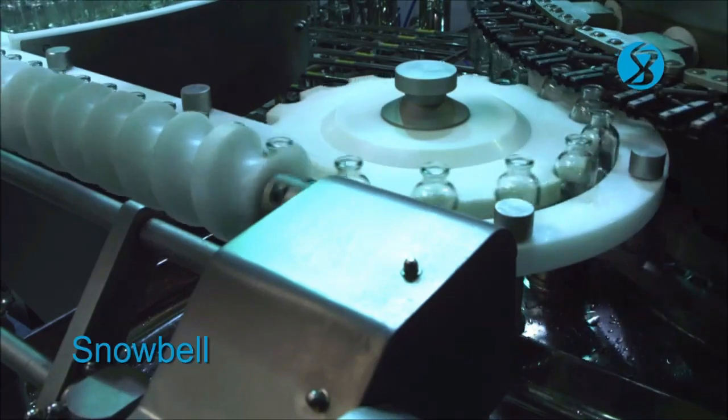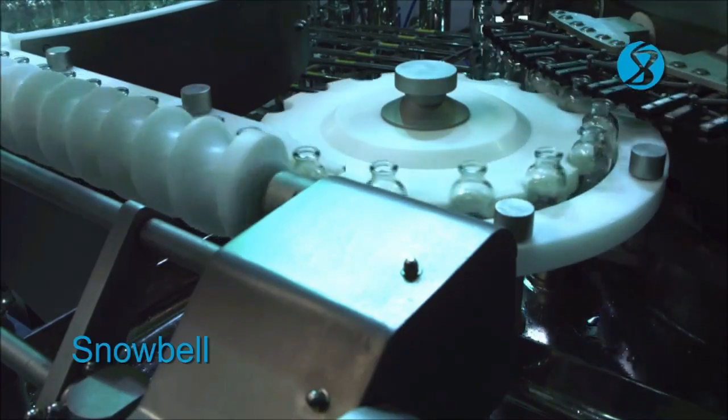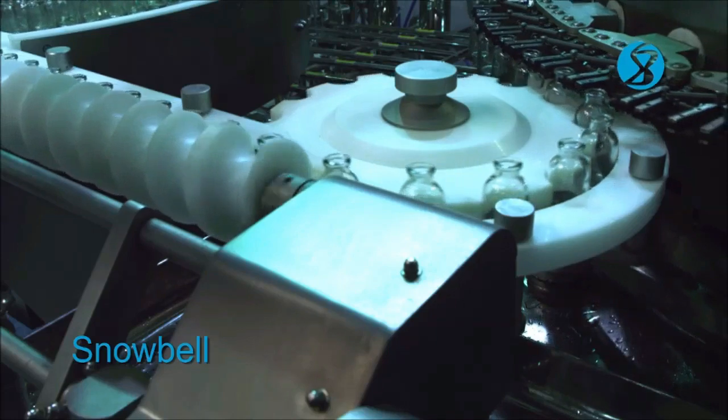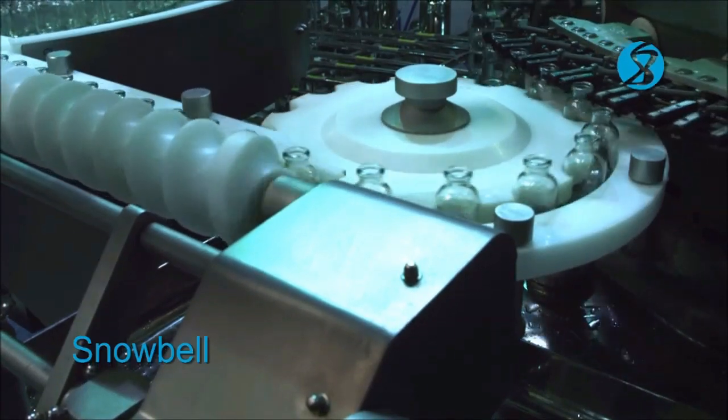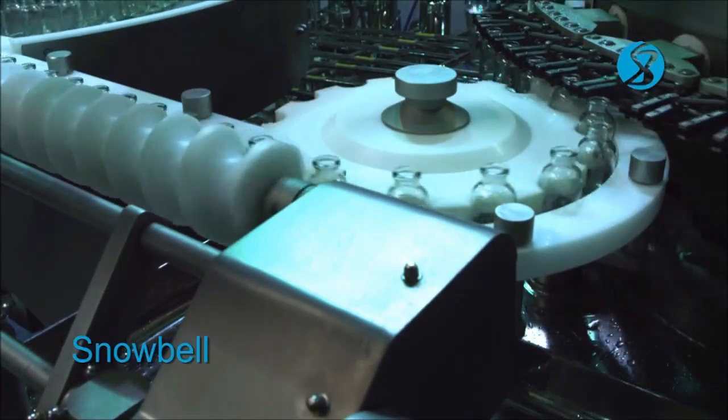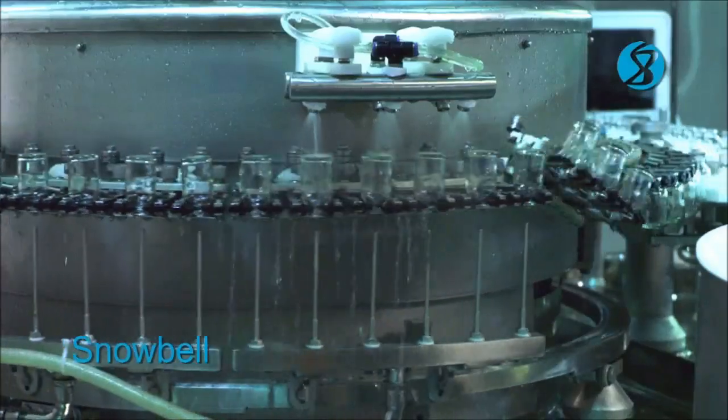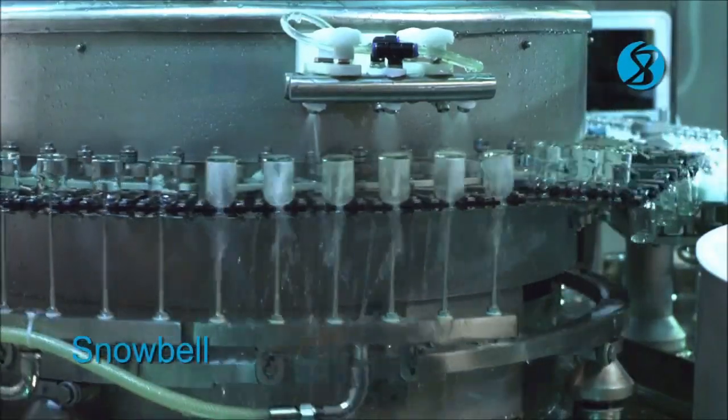Each vial is held by its neck. V-grippers rotate the vials by 180 degrees neck down. The vials are then passed through the cleaning stations upside down.